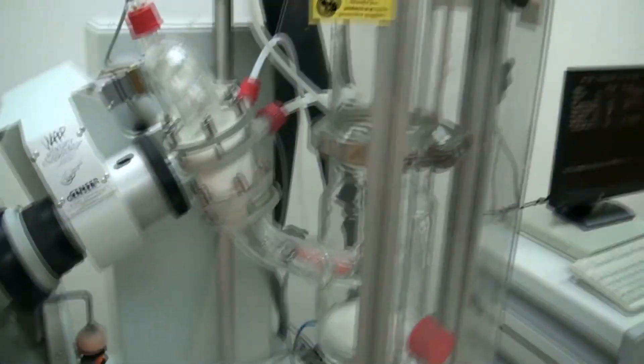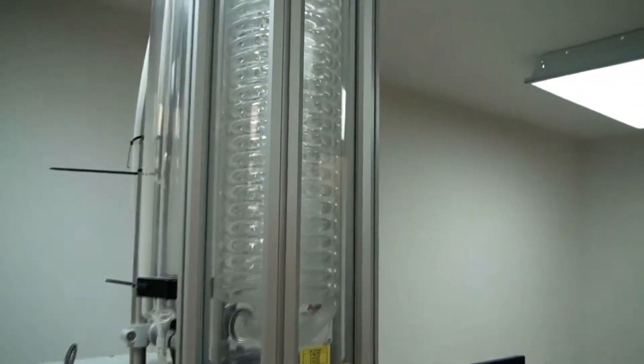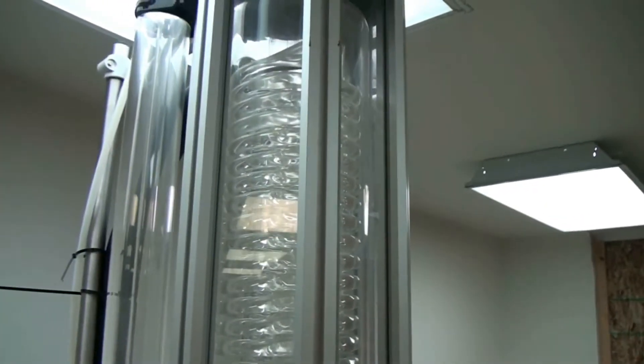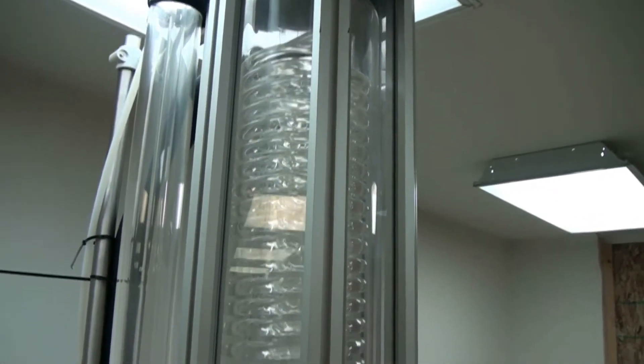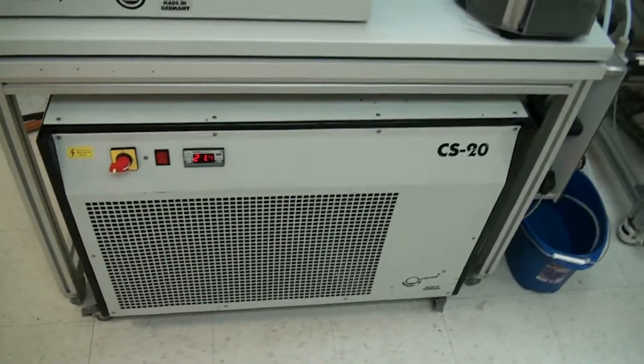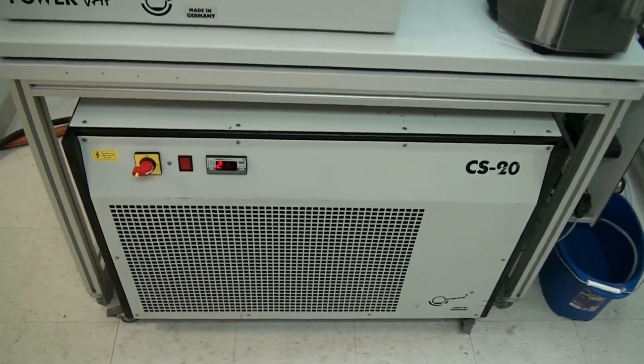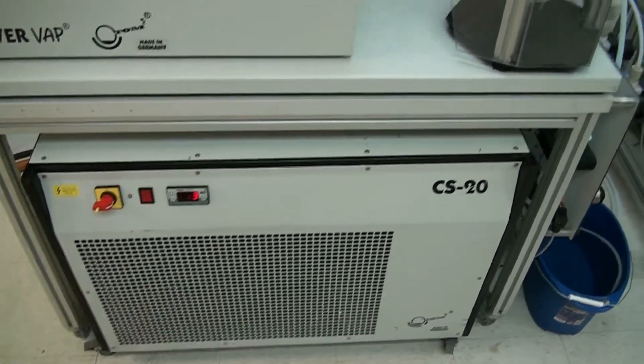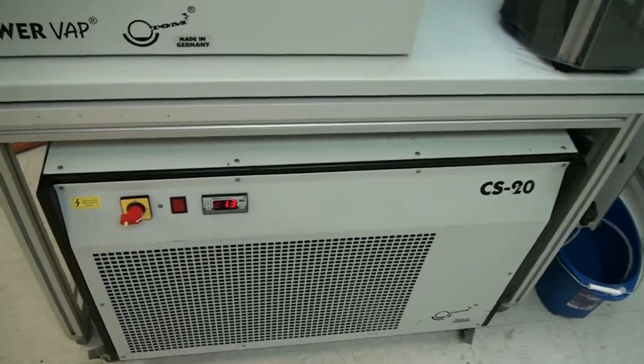You can see the tower here where it houses the coil. That's where the fluids from your chillers continuously flow through it. The chiller is down underneath here, very large chiller. It has no problem keeping up. We've tested it to the specs and along with the bath we tested it to spec too.